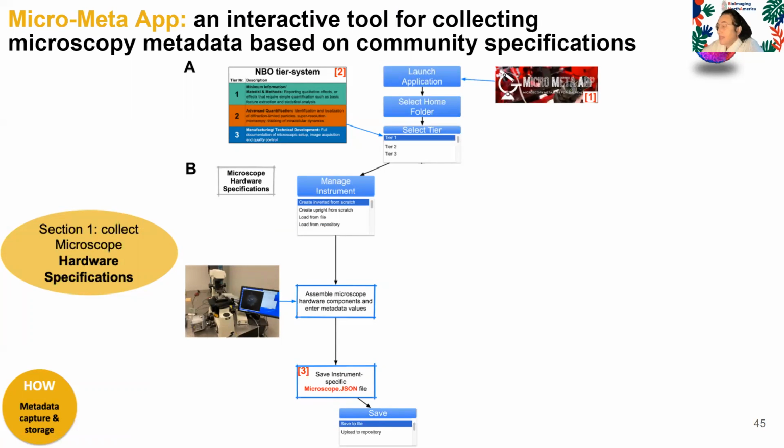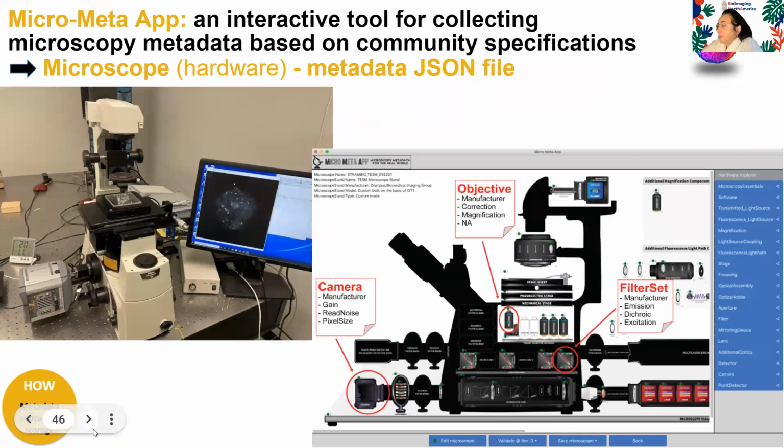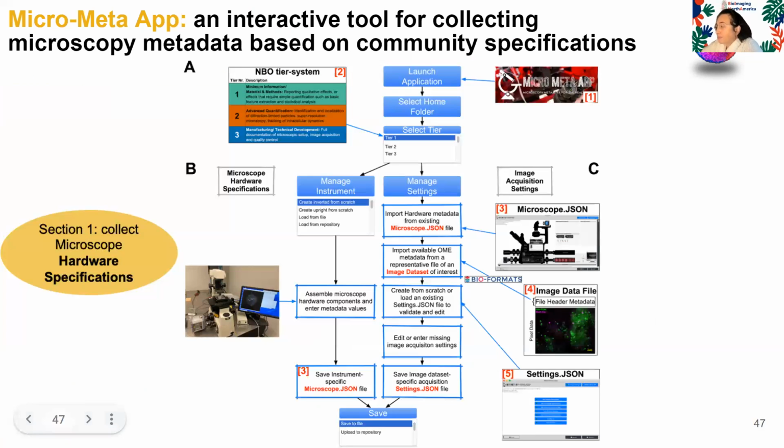So it really brings to life a virtual representation of your microscope in a very intuitive manner to produce a JSON file that contains the information specified by the community specification. Basically, it allows you to drag and drop different components, a little bit like a video game, and allows you to enter information about each of the components. The second part is it utilizes the description of the microscope and allows you to then extract information from your images to enter information about how the specific image or image data set was acquired.